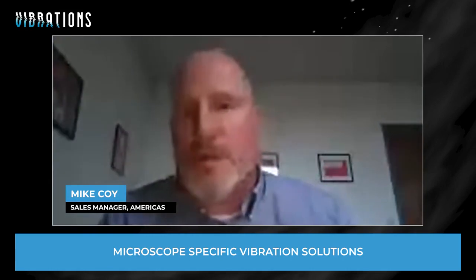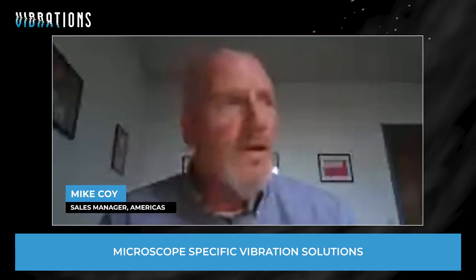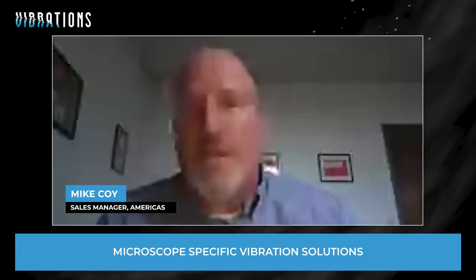So as you can imagine, in essence, we're working with a much less intense flashlight and still trying to see more, right? So we have to spend more and more time acquiring images, and stability increasingly is the limiting factor in what happens. So the absolute state of the art TMC active systems are the only possible chance to succeed in situations like that.